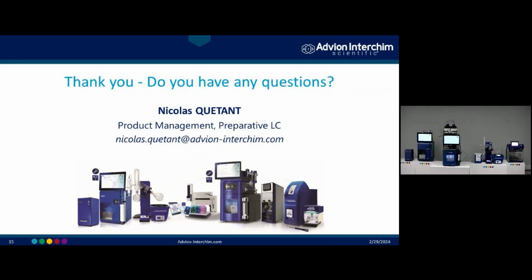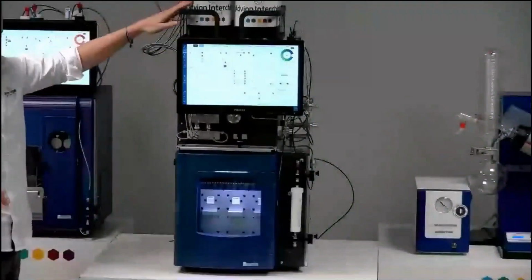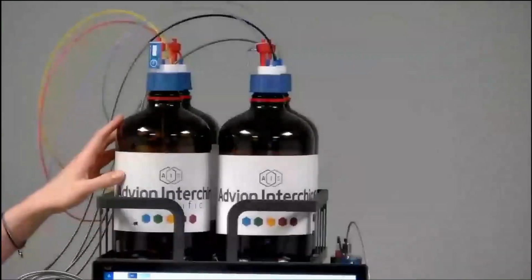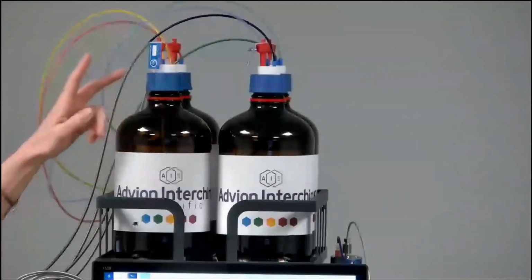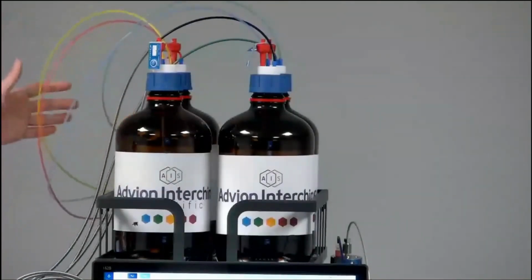Okay, that's a good question. So let's have a look on the system. If you look at the top of the system, you have a solvent tray, and on it you can put up to 5 bottles of 2.5 liters. So that means you can have 2 bottles for normal phase, 2 bottles for reverse phase, and another one for a cleaning solvent.